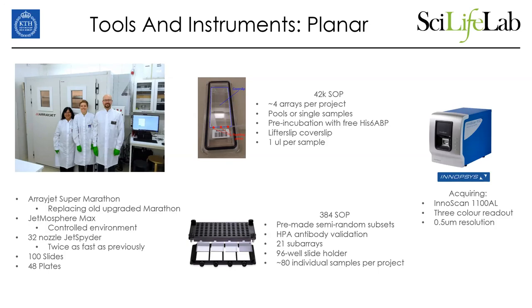For the readout, we're buying now our fourth scanner. This is the Innopsys InnoScan 1100 autoloader. It has a three color readout and a 0.5 micrometer resolution. We also have a Capital Bioscanner, which we have been using for many years now. And actually today I took our old NimbleGen scanner, which is a rebranded Tecan scanner, down to the recycling room.